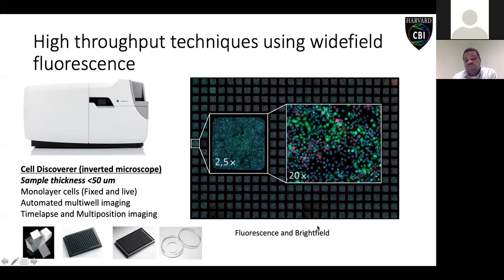So in bright field mode, you have samples which are either non-stained or stained with a dye which has no fluorescence. You will be able to detect that sample using the ELIRA. And I'll give an example in the next slide.